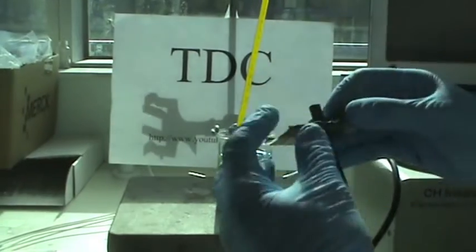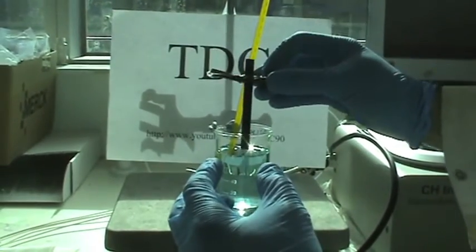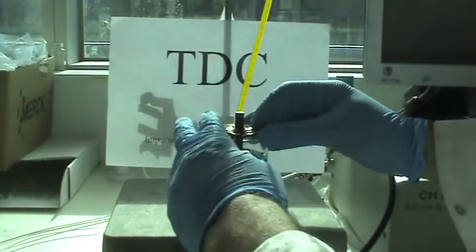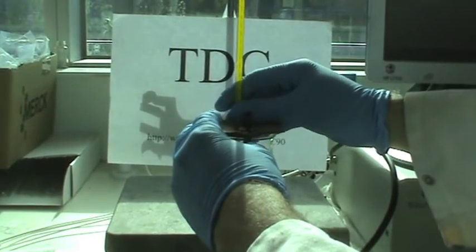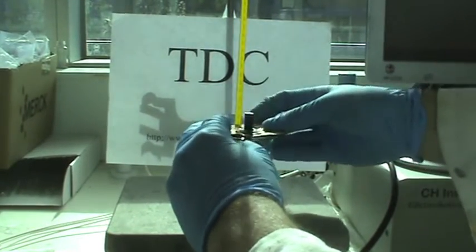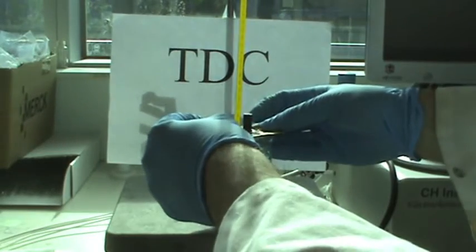After the addition of the plating solution, place the cell onto the heating mantle and heat until temperature registers between 40 to 60 degrees on the thermometer. Attach the pre-cleaned graphite working electrode onto the lower middle side of the cell.